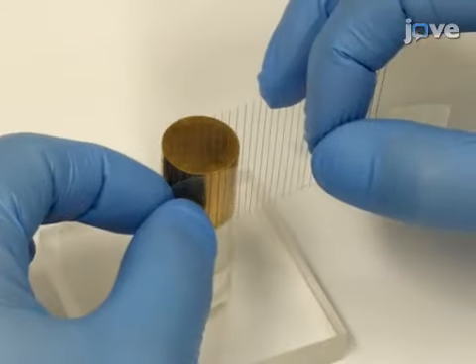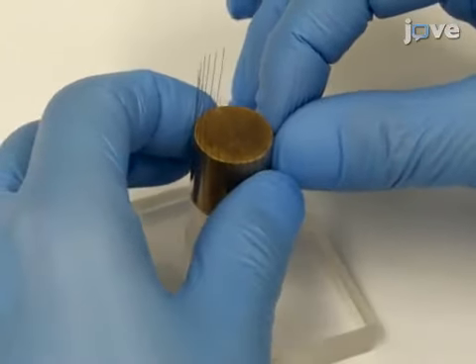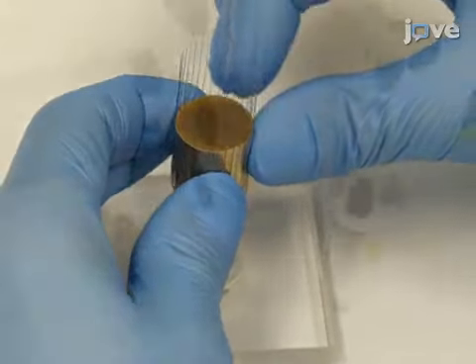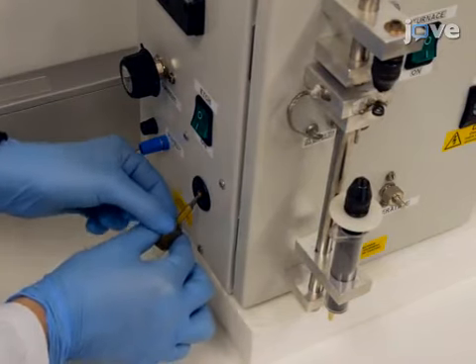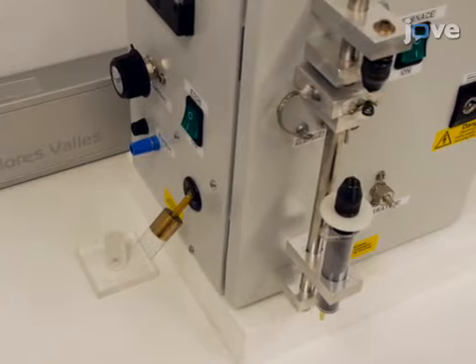Then, roll the tape onto a polished brass spindle and hold the wires firmly against the spindle so there is a good electrical connection. After that, connect the spindle to a 5 rpm motor in the workstation. The spindle axis is angled 45 degrees relative to the surface of the etching solution.